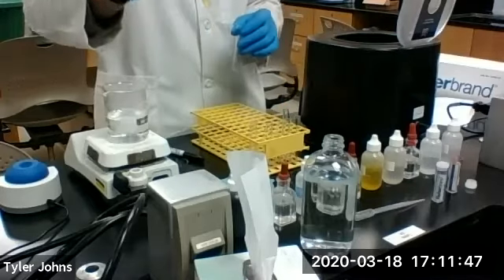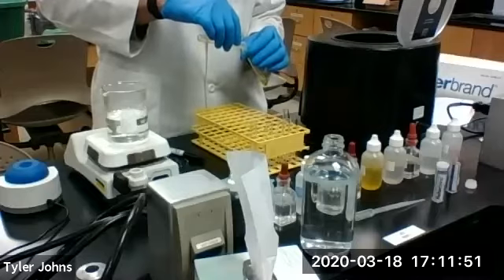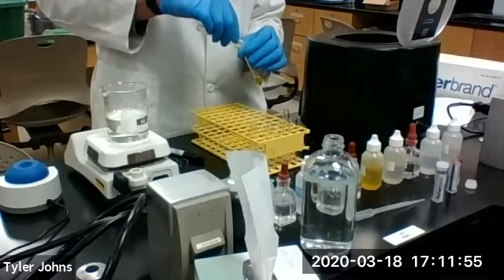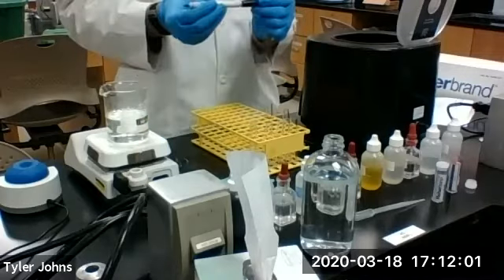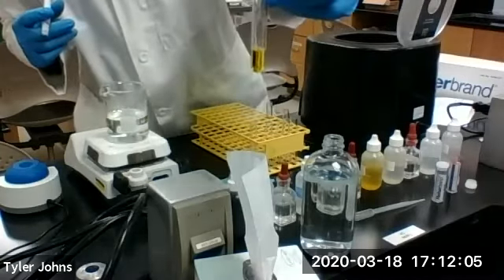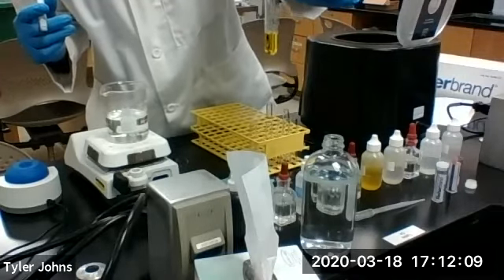We'll now decant the solution. This solution is solution 15, and we'll label it S15. It will be saved to analyze for calcium ions.